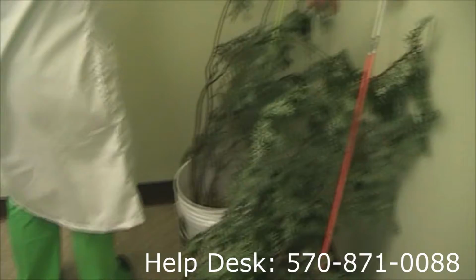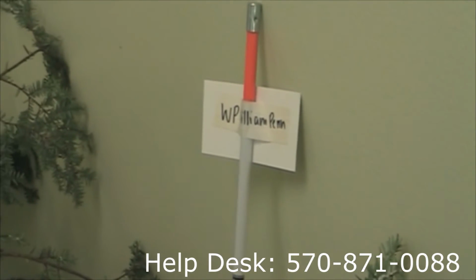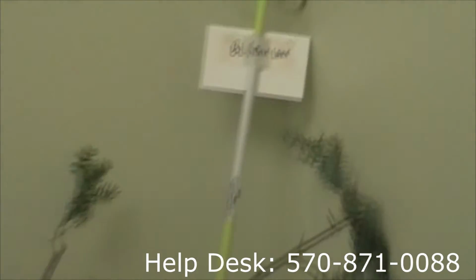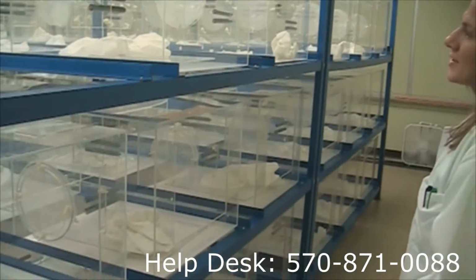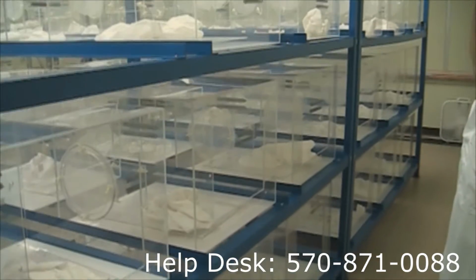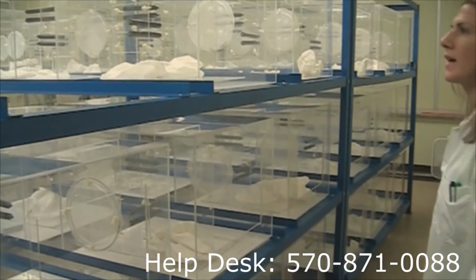This is how we distinguish food from location that we collected it. If anything ever ends up contaminated, then we can locate that by one box and then make sure that we aren't shipping contaminated materials. And this is the line of our boxes, the first line. There are several. We're expecting 5 weeks of activity from egg to adult, so we're going to try to go through here and hopefully have a section per week to be shipping out.